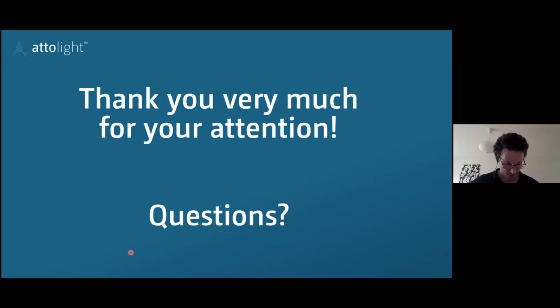Did you measure anything that has a grating pitch of less than 100 nanometer? So we're talking about the semiconductor that's patterned, and then you want to know the impact of this pattern on the emission of light? He's asking about the scattering of the nanostructure. So the scattering of light as it emits? Yes.